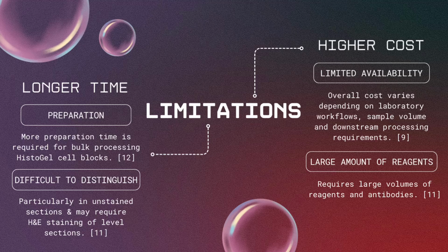Lastly, while histogel is marketed as a cost-effective method, its overall cost can be higher and availability limited, depending on workflow, sample volume, and downstream processing requirements. Histogel applications, particularly those involving whole mount staining, are low throughput, time-intensive, and require large volumes of reagents and antibodies.